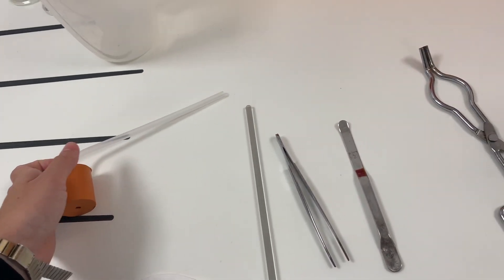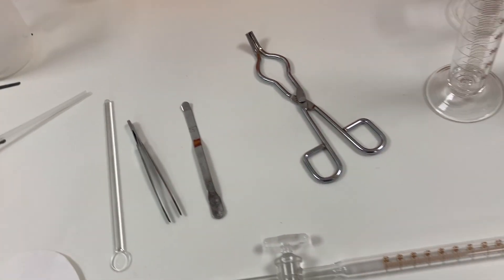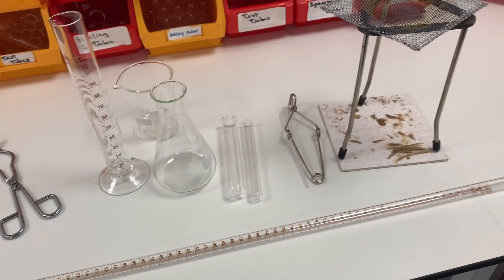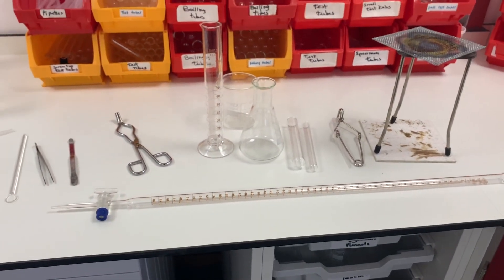I'm just trying to familiarize you with various pieces of equipment used in scientific experiments.